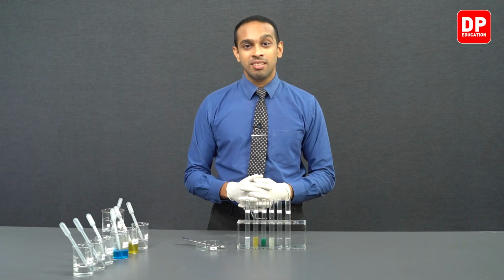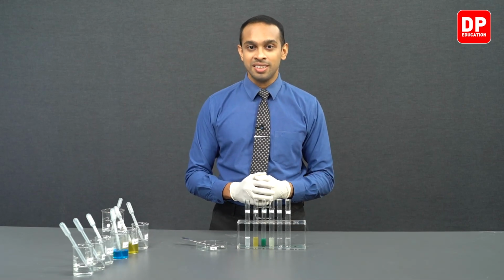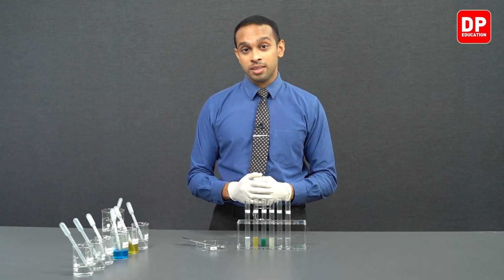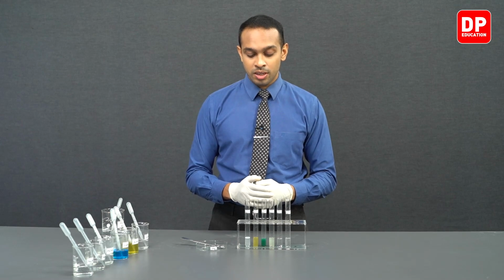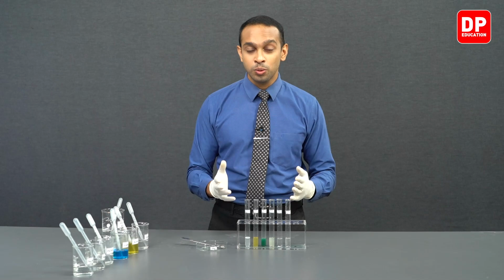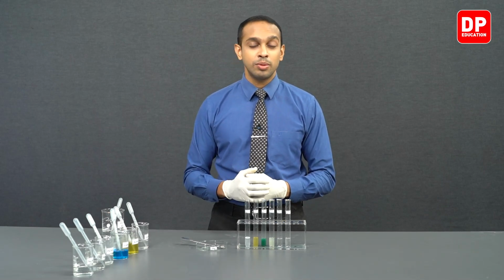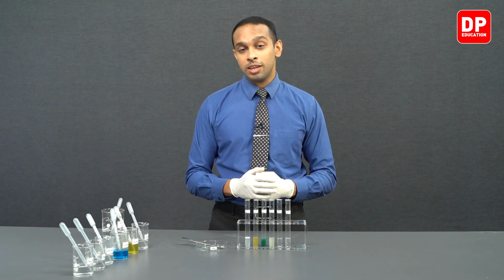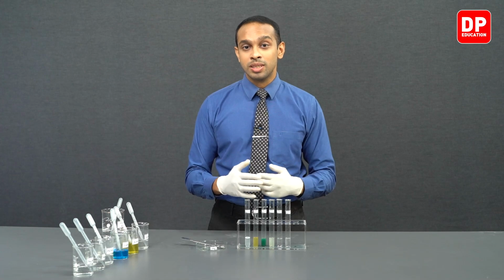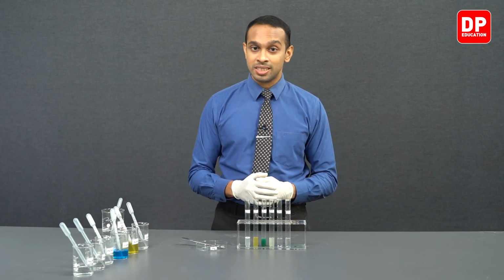Now students, let's observe out of the solutions that we took into different test tubes here earlier, which solutions have shown a reaction with magnesium. Now we know magnesium is in group 2 and it's a very reactive element compared to most other elements that you find. And if you remember the electrochemical series, magnesium is present higher up on the electrochemical series.